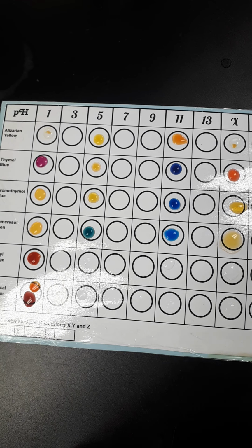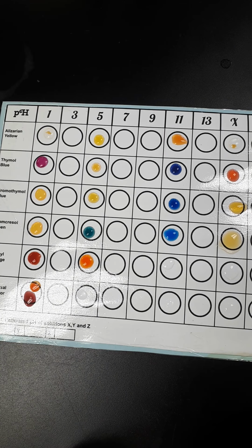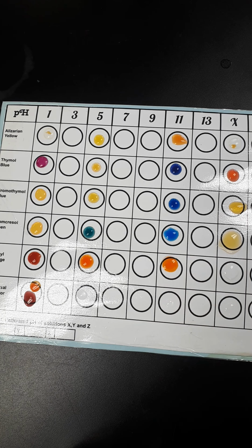Okay, last couple to check out. Methyl orange. So in a pH of 5, looks pretty orange to me. Let's double check our periodic table. Methyl orange in a pH of 5 should be more on the yellow side, but it looks kind of orange to me. Unless I looked at the wrong one. In a pH of 11, methyl orange should be yellow. Maybe there's something funky going on with this one.